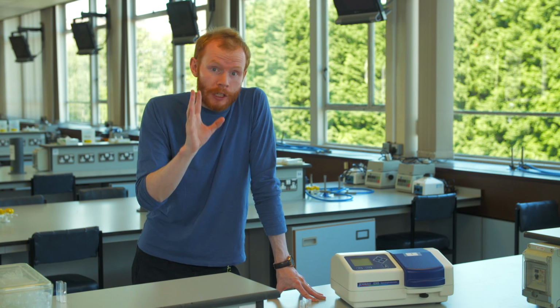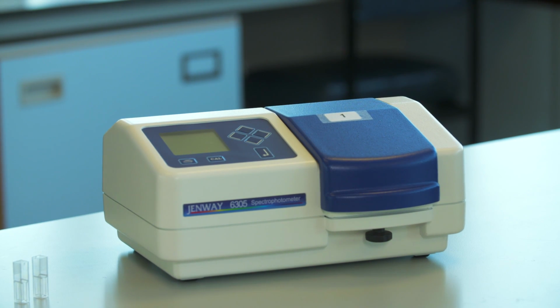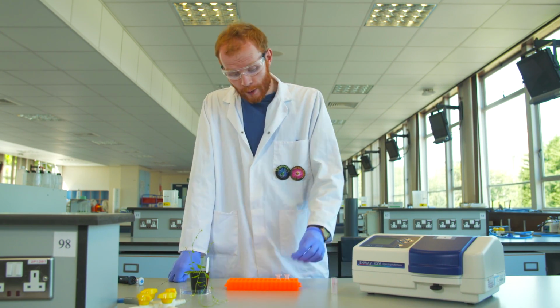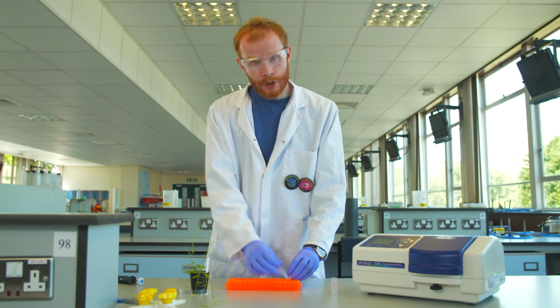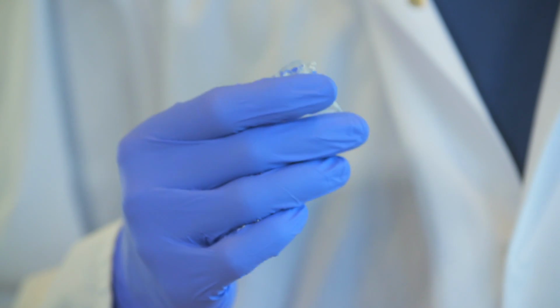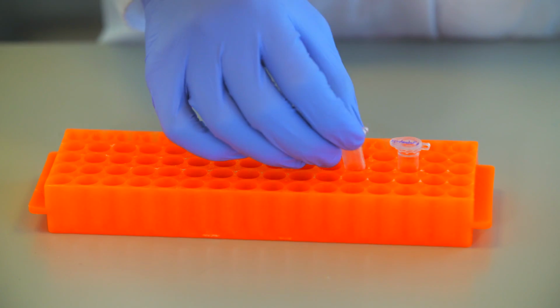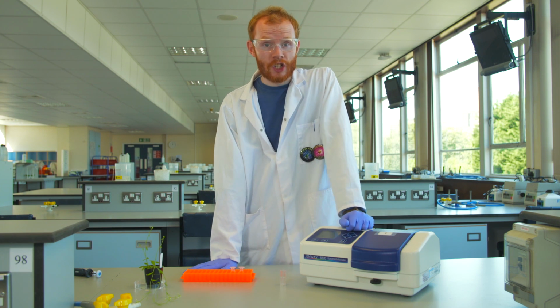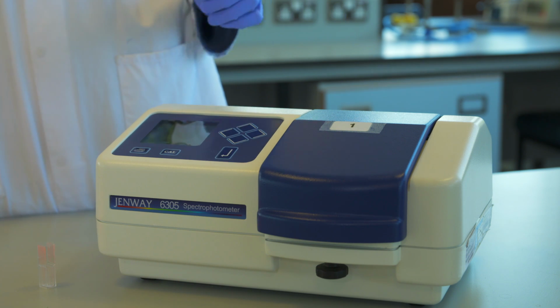Now, this can be done using the exact same theory and equipment that we might find in an A-level biology classroom. In order to measure the rate of pyrophosphatase activity, we need some pyrophosphatase enzyme that we've isolated from plant pollen, and we also need a substrate solution that's going to change colour as we proceed through our reaction. This substrate solution contains ammonium molybdate and iron sulfate and should turn a blue colour following enzyme action. In order to detect this colour change, we're going to use a spectrophotometer, which is essentially a fancy colorimeter.